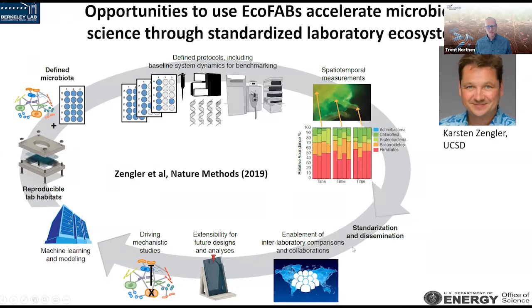It shows this vision for a workflow where you create reproducible laboratory habitats and defined microbes, microbiota that are accessible to anybody in the community, say through a tissue culture collection. Use 3D printing to make these devices, so anybody can make them now, given the widespread use of 3D printing. You create defined protocols for how to do the metabolite extraction, the DNA extraction, proteomics, et cetera. And baseline measurements so that people know whether their laboratory ecosystem is behaving to specs, so to speak.